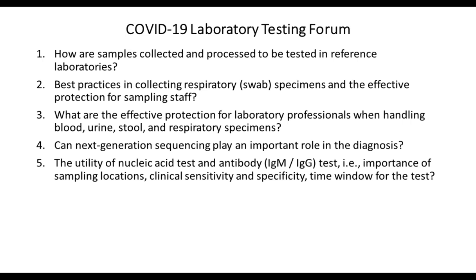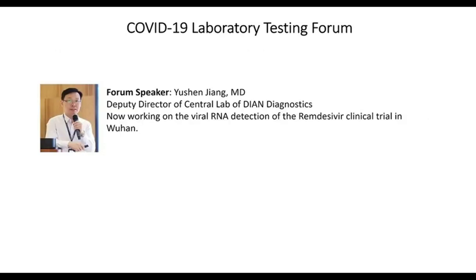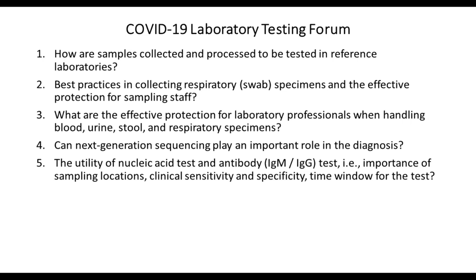Is that really safe? I don't think so, because I think that every kind of sample is very dangerous. Although maybe you cannot detect the virus RNA because of the sample type or other things, it doesn't mean that the virus does not exist. So I advise you to treat every kind of sample with the same degree of care. I see that. Yeah, thank you for the great answer.